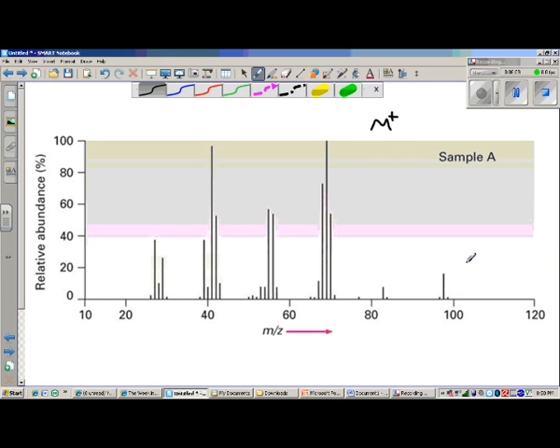So as you get bigger, the sizes of your species get bigger. What this actually means here is the M+ peak here is actually this one. This is our molecular ion peak. The scale here isn't shown very well, but this has a mass to charge ratio of 98 units. Meaning the molecular weight of this sample was 98 AMU, 98 grams per mole.